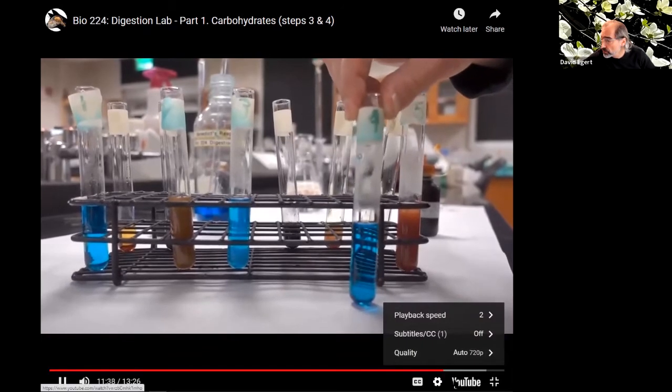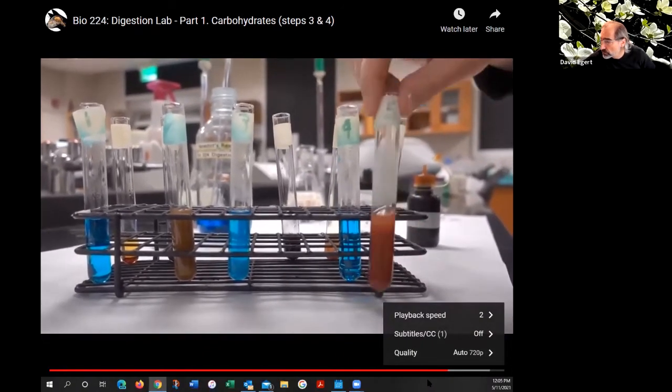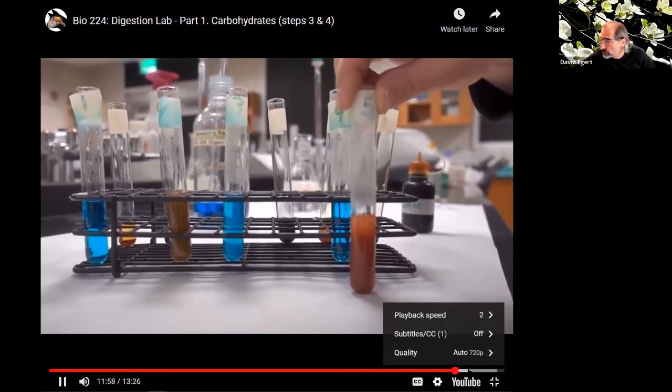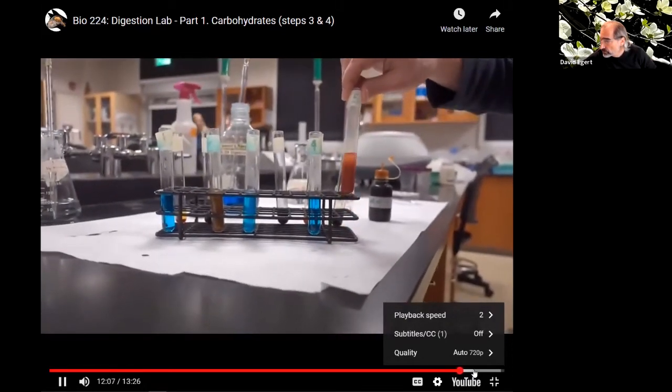This was pure starch in here without any maltose, and this shows from Benedict's that there is no maltose present because it's staying just blue. This would be a very strong positive reaction with Benedict's where it turns this reddish-orange. Again, there's a whole range of colors it can turn. It can turn from kind of greenish all the way to this kind of tomato red-orange, and that would all imply the presence of maltose in our case here.